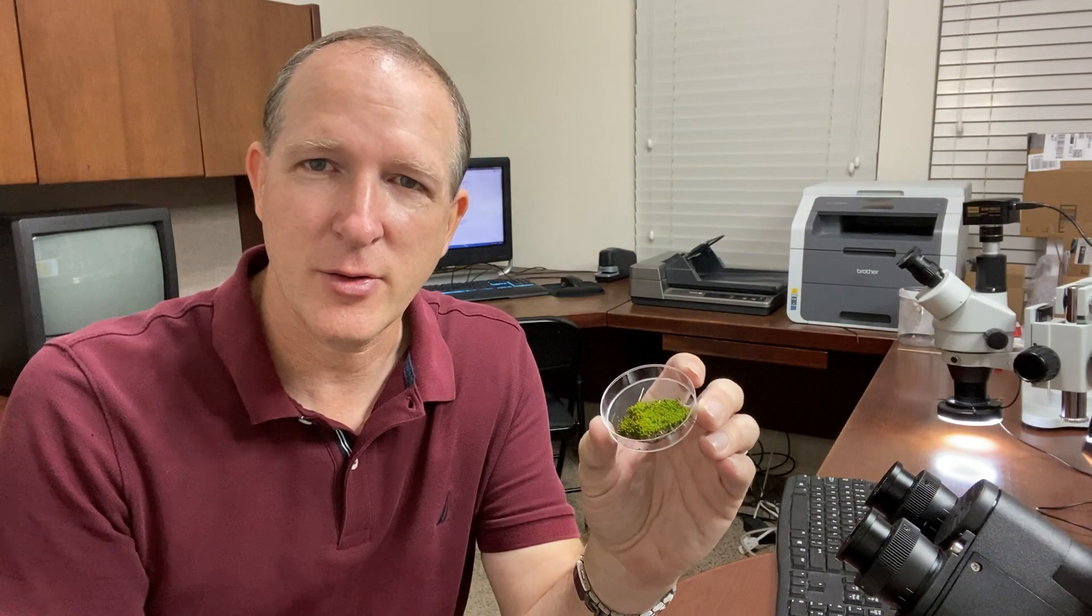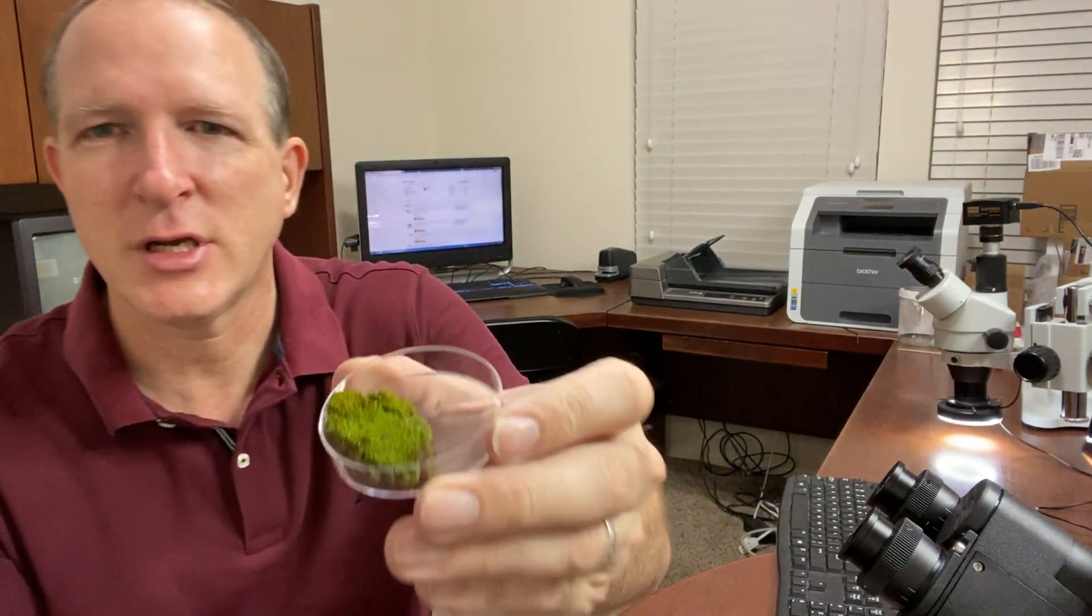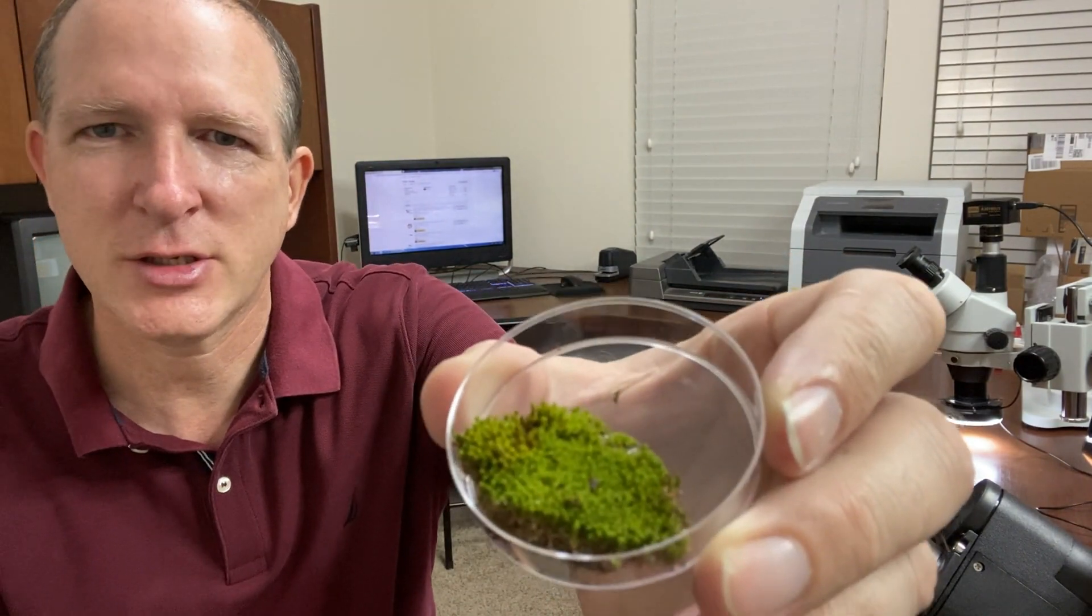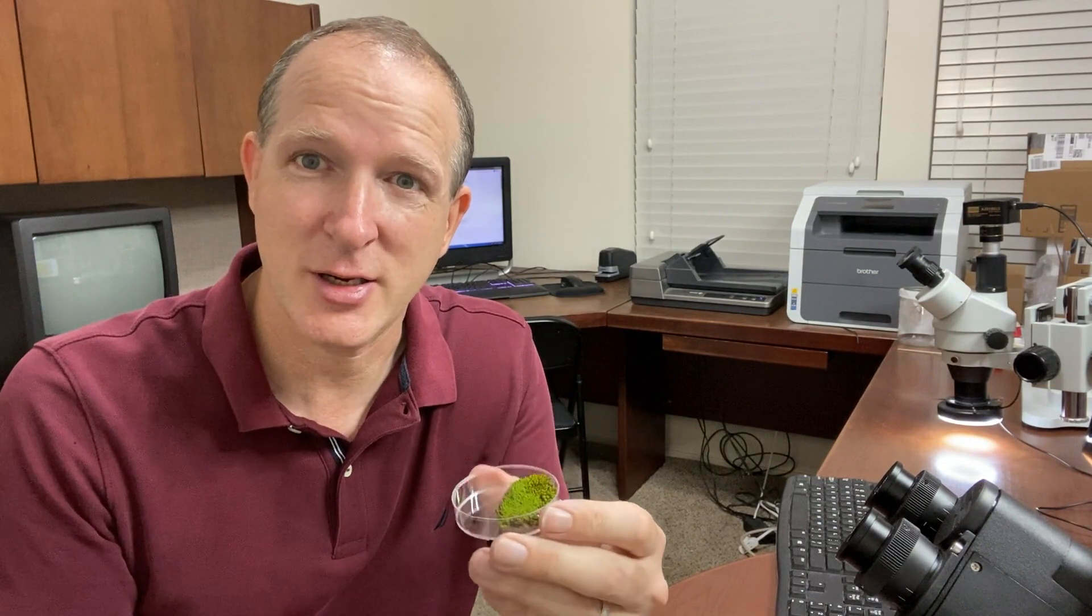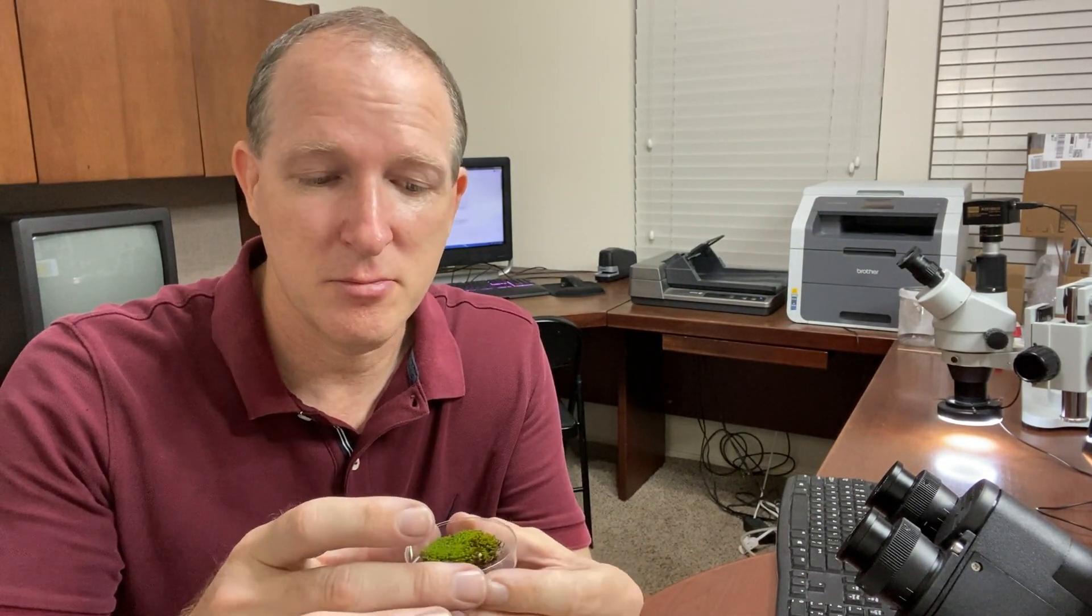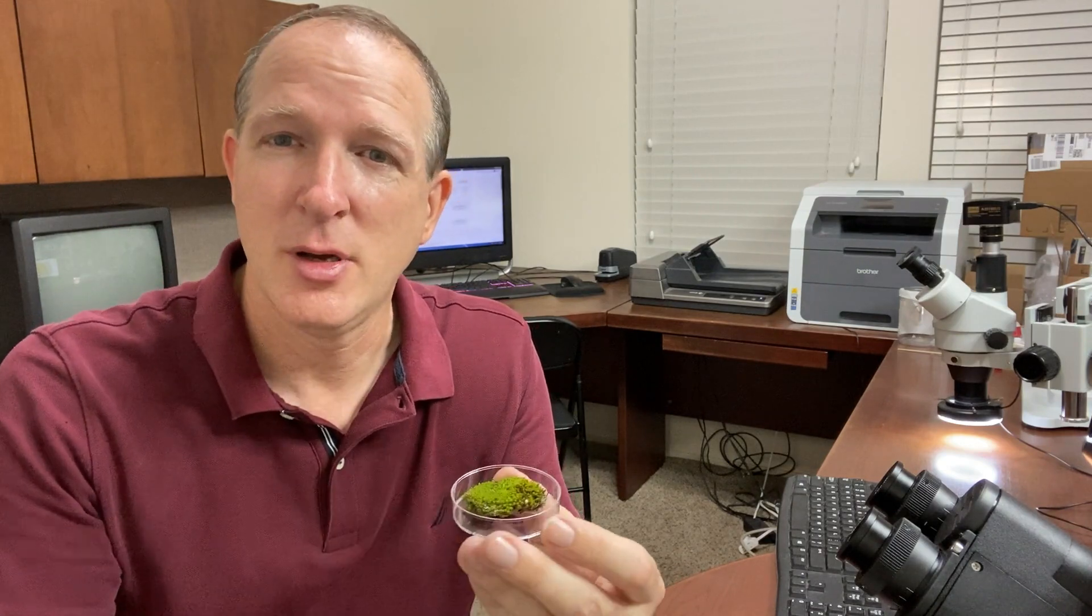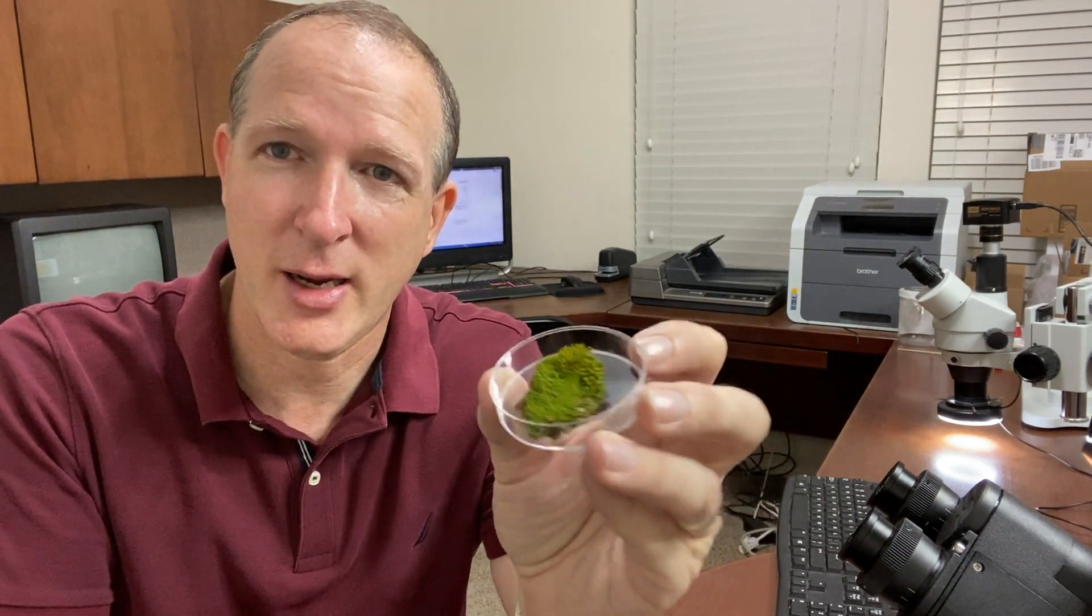Hey there, David here. I am going to give a little quick video on some moss that I found in my backyard. It's really cool looking under the stereo microscope. As you can see, it's just typical moss that you would find in a shaded area. I found this on the side of my house and it looks really neat without even the microscope. But let's take a look at what it would look like when we get it magnified.